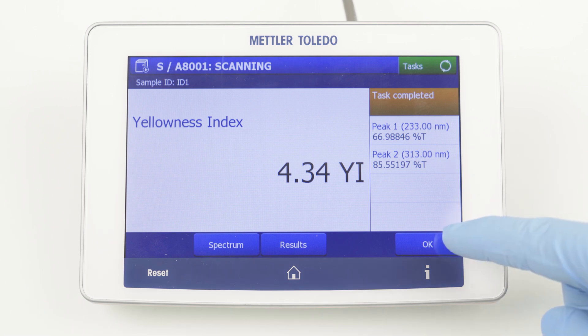With the button Calculated Results, you can switch between the spectrum and the calculated results, which is in this case the yellowness index of your sample. I hope this short video was helpful in understanding how to set up color measurement with our UV-Vis Excellence Spectrophotometers. This analysis can also be automated with our cuvette changer for up to 8 samples, or for up to 303 samples with our InMotion Auto Sampler. Check out our automation webinar or our automation guide here.